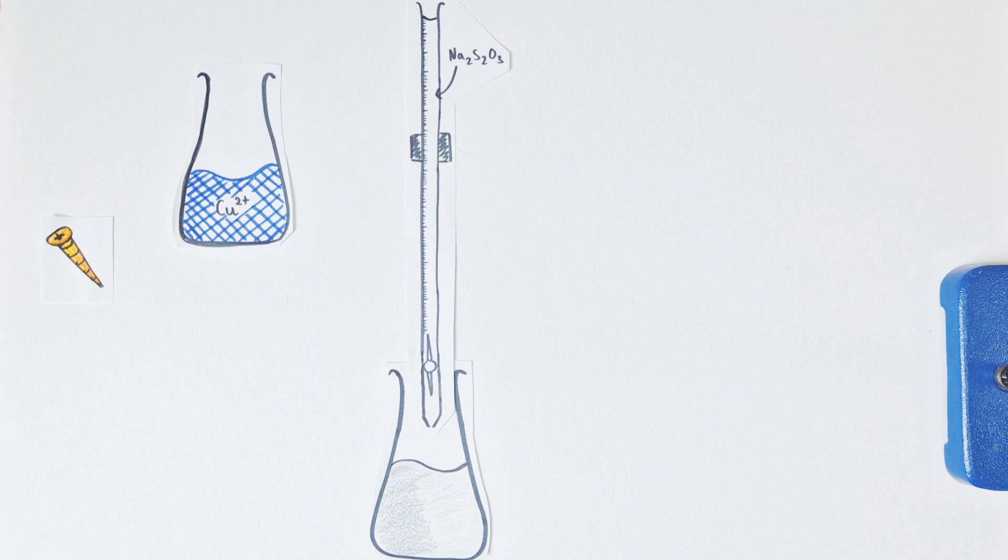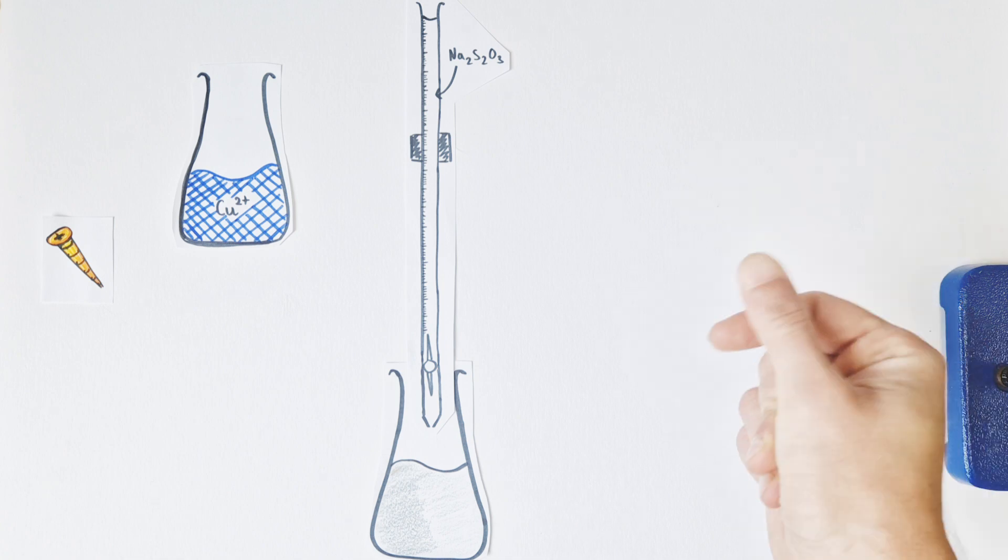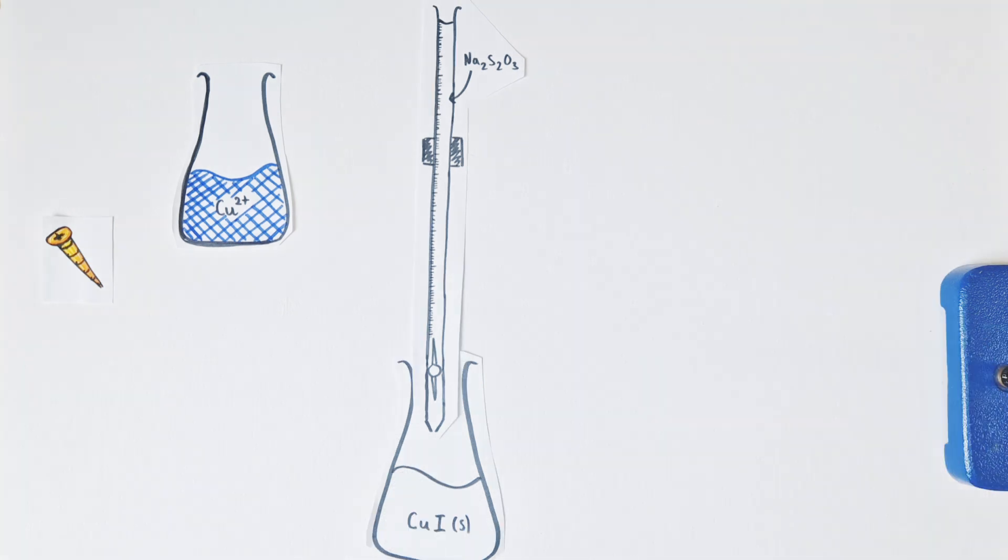Because iodine reacts with starch to form a blue-black color, we get a deep black appearance to our conical flask. This is much easier to indicate the endpoint. As we add a little bit more of the thiosulfate solution, we're looking for that blue-black color to vanish and disappear and be left with a white color like this. And that white color is indicative of only the copper iodide precipitate, which is a white solid, being present.